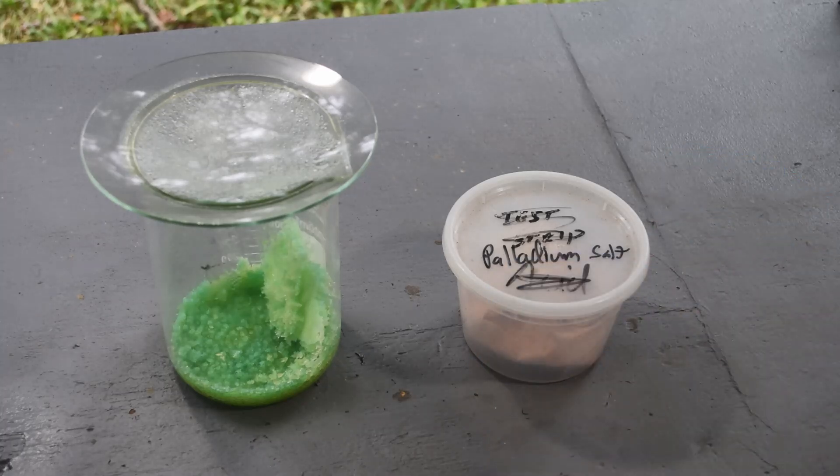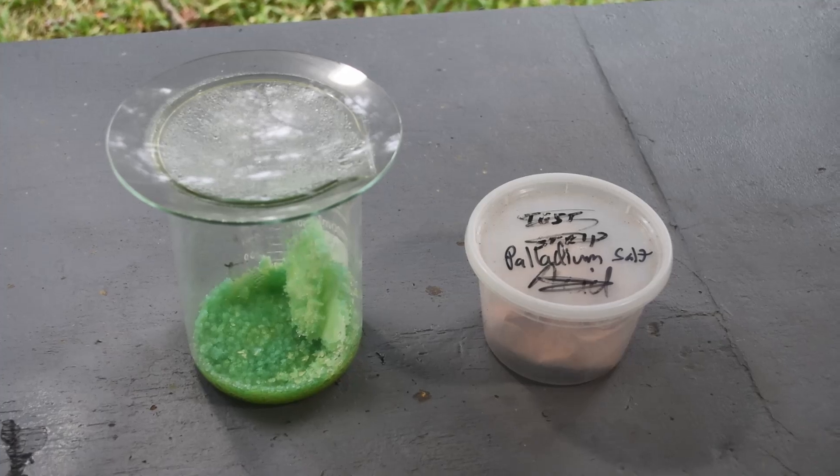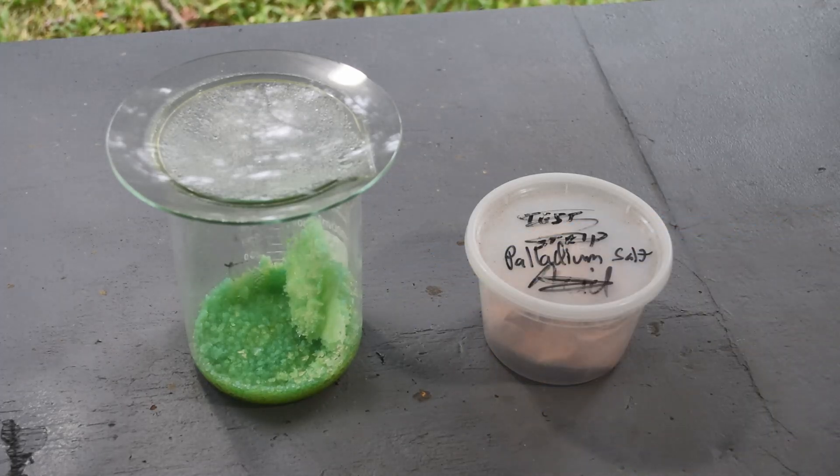Over here, these strange green crystals are the result of an abortive attempt at getting more palladium out of this stuff. I screwed this up royally — screwed the pooch — and we lost some of the palladium. But I'm wondering if a lot of it is still in there, because this showed a really strong indication for palladium with a stannous chloride test. It looks like most of the copper stayed behind, so maybe most of the palladium stayed behind too.